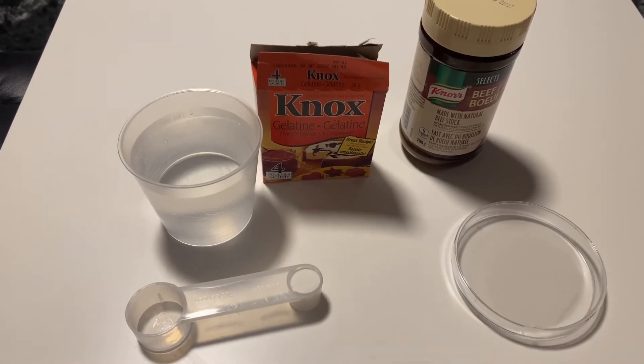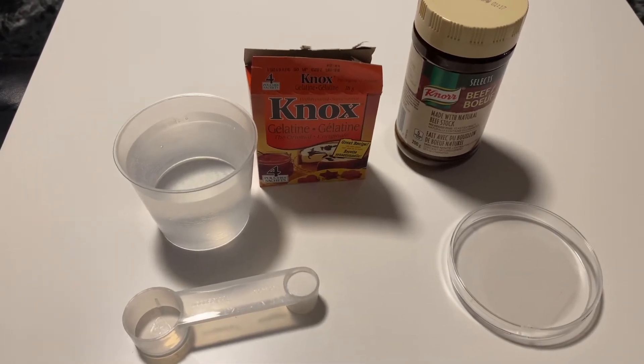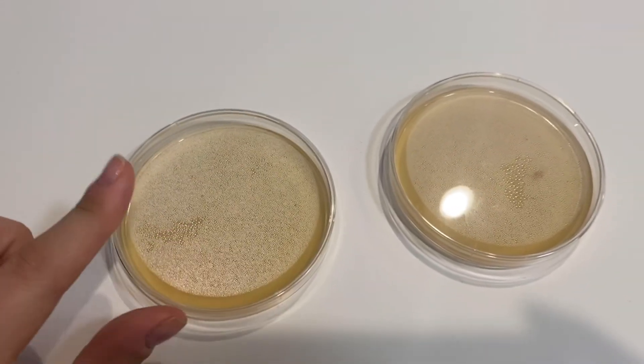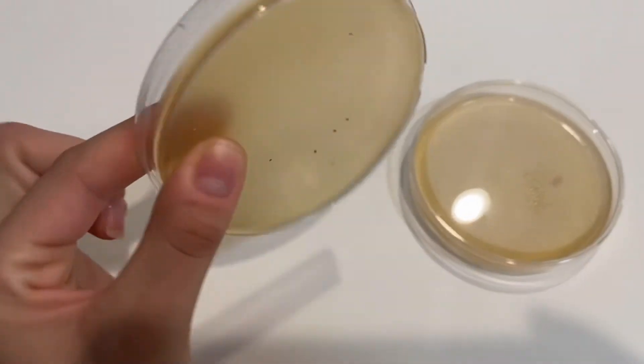In this project we will fill 2 agar plates, half of them. Then we leave in the fridge for 5 to 6 hours. As we see already, I left them for 5 hours in the fridge and now the agar plates are ready.